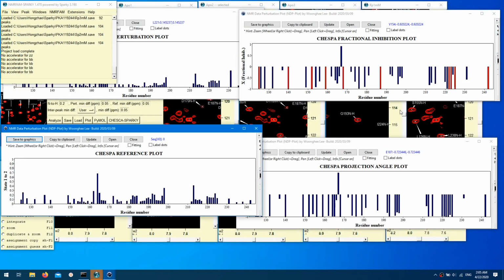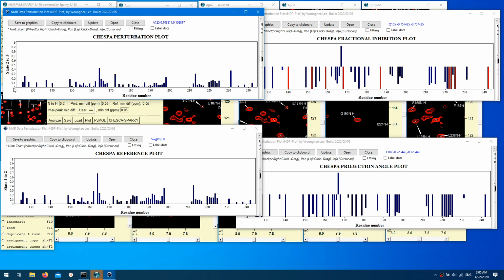You will see that many bars are marked red. This is because in many cases, some values are much greater than 1 or lower than -1, and they will effectively suppress other bars. When such residues are significant, the perturbation analysis is affected. So we mark them red and keep the y-axis ranges from -1 to 1 or 0 to 1.